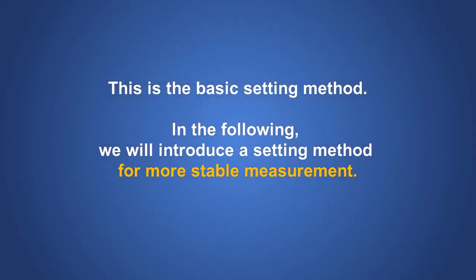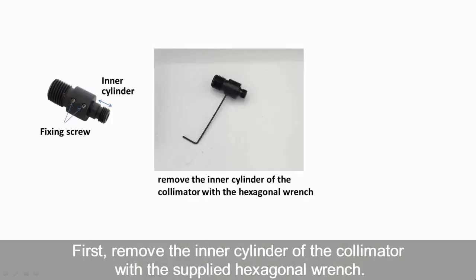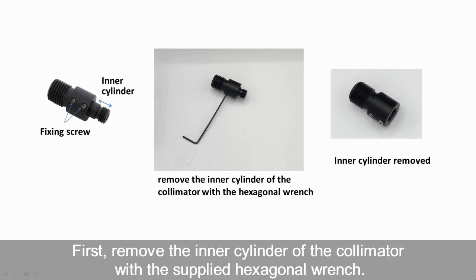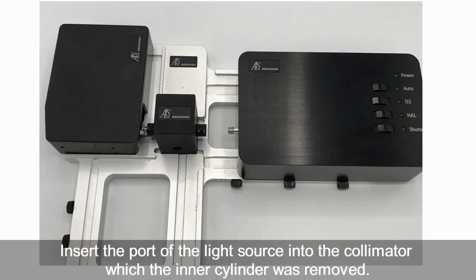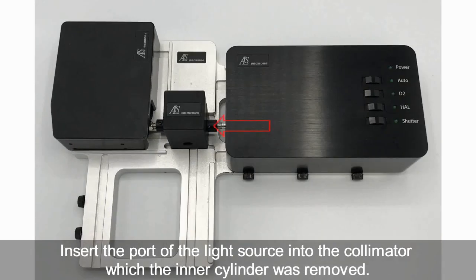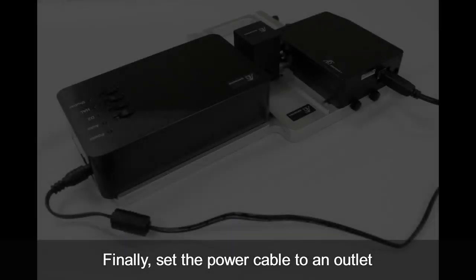In the following, we will introduce a setting method for more stable measurement. For this way, the collimator is attached to the right side of the cuvette holder, the light source side. Before fixing the collimator to the cuvette holder, first remove the inner cylinder of the collimator with the supplied hexagonal wrench. Attach the collimator with inner cylinder removed to the right side of the cuvette holder. Insert the port of the light source into the collimator from which the inner cylinder was removed. Then tighten the side screws of the platform to fix the light source.